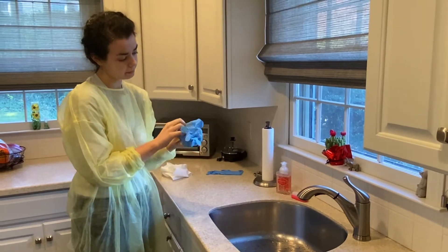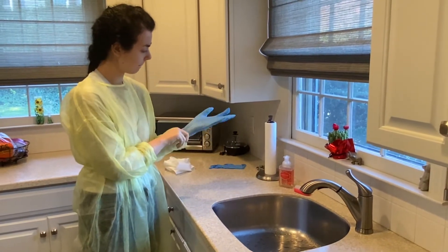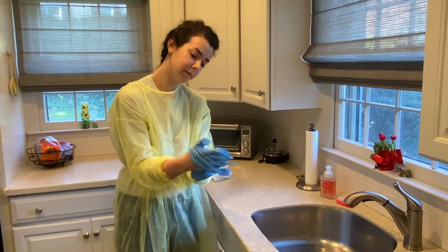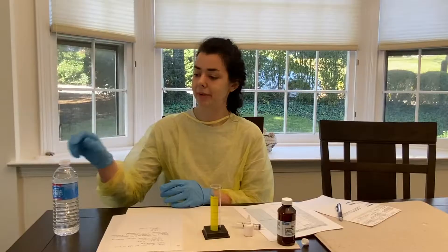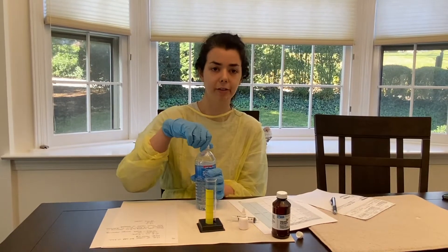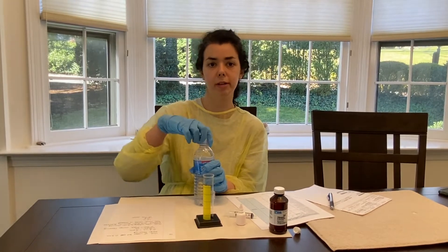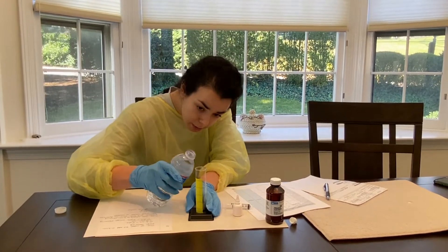Now I'm going to be putting on my gloves. And now we're going to prepare the prescription. I'm going to be pouring the water into the graduated cylinder — just a reminder that I will be pouring in 14.7 milliliters and I'll be adding in six drops of the orange flavoring, which will translate to 0.3 milliliters, to bring the medication up to 15 milliliters. So I'm going to pour in the liquid now.